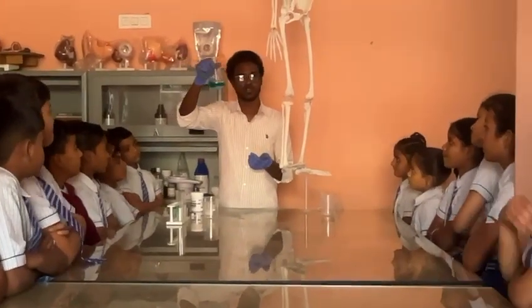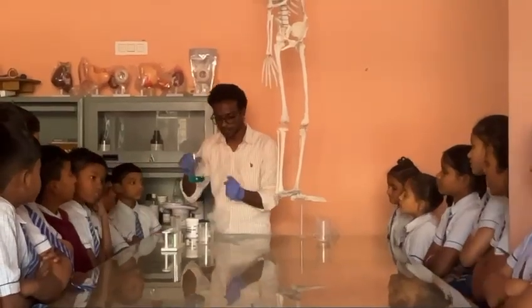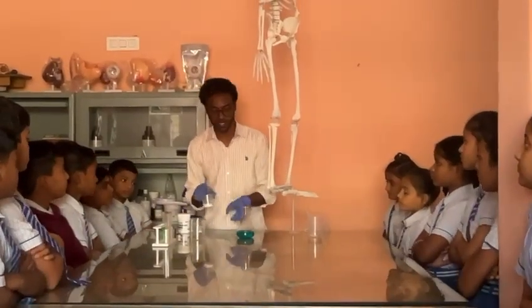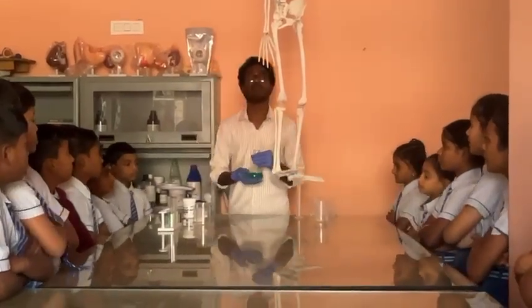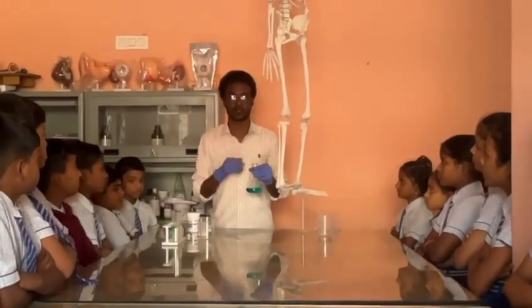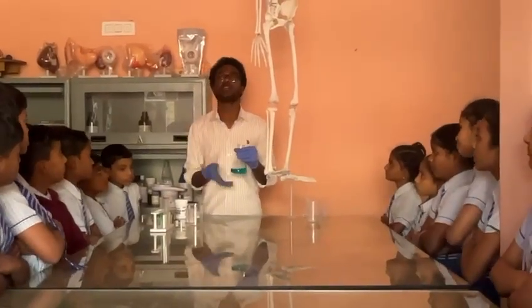So this is the color change reaction between copper sulfate and sodium chloride. Remember, whenever we mix copper sulfate with NaCl, the chloride present in NaCl reacts with copper, Cu.